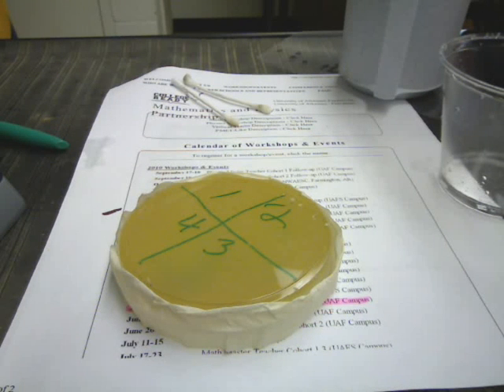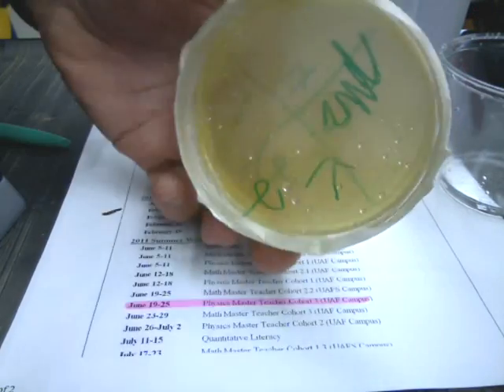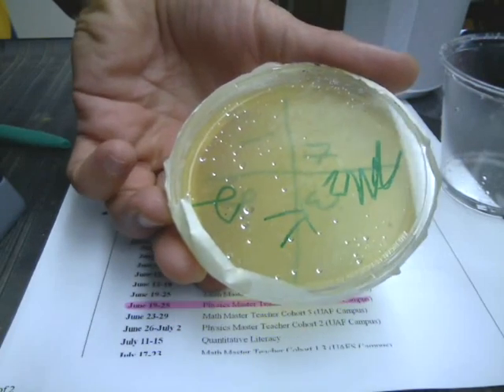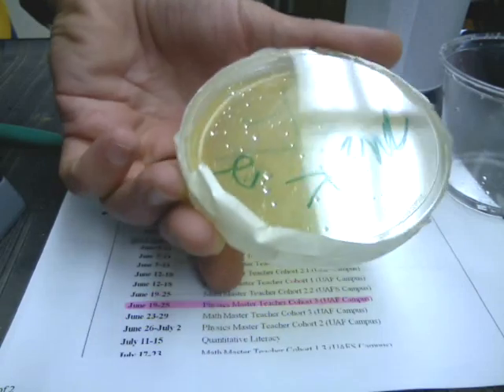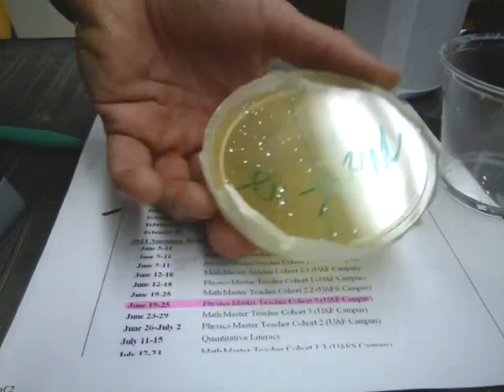All right students, we're gonna have a quick look at how to use a petri dish and how to treat one. This is a petri dish and it contains a substance called agar, which is basically gelatin, but it's not animal gelatin like your jello. This is seaweed gelatin, vegetable gelatin. It's a little better for this purpose.